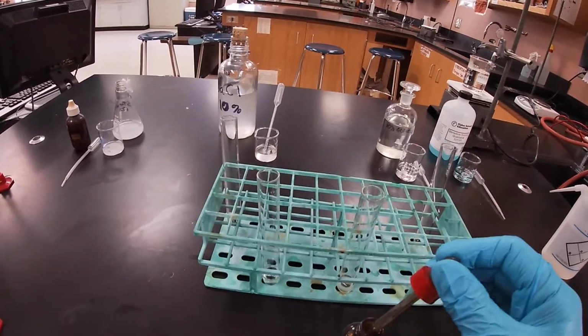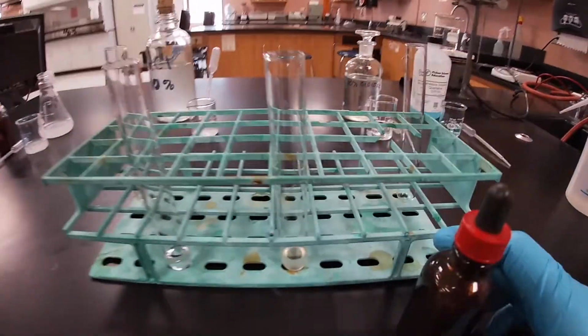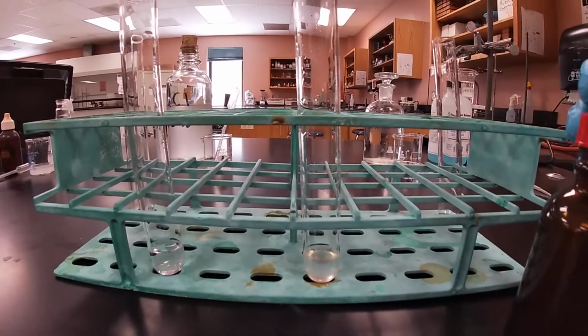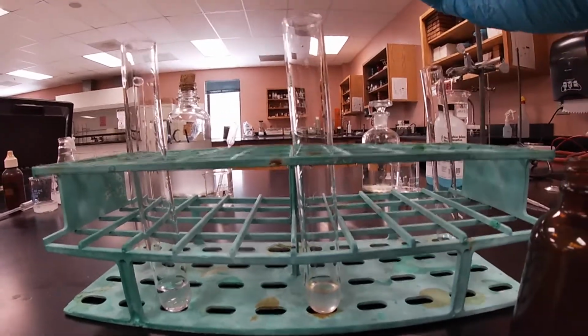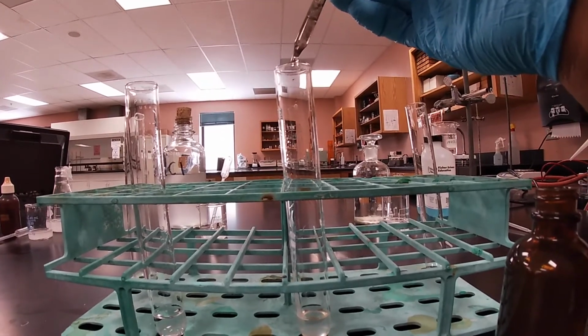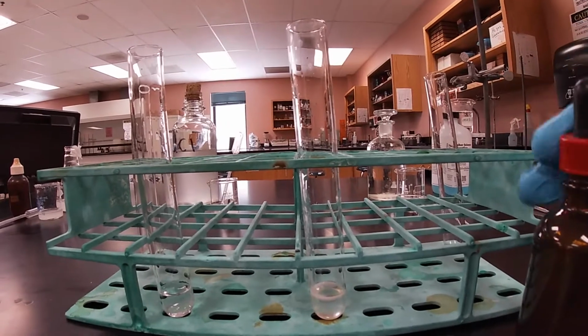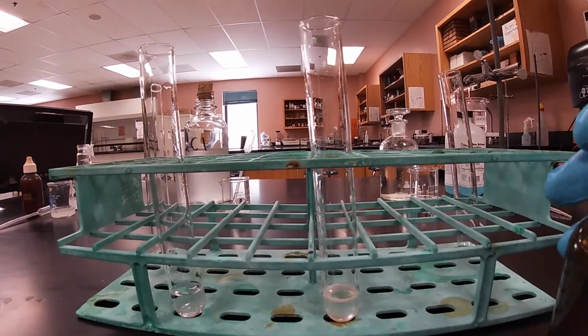Okay, so let me get some. I'm going to add 2 drops. I'm going to go ahead and move to the side so that you all can see. So we're going to add 1 and 2. All right, so we're going to add 2 drops. We're going to go ahead and stir.